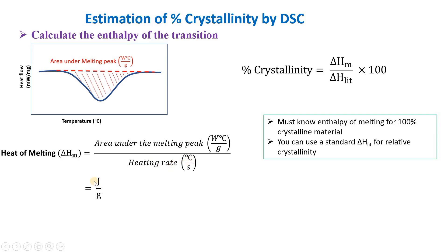The unit of enthalpy will be Joules per gram. The formula for percentage crystallinity is the enthalpy of melting divided by the enthalpy of a pure 100% crystalline sample, which gives the percentage crystallinity. This reference value is obtained from a standard table when doing DSC analysis.